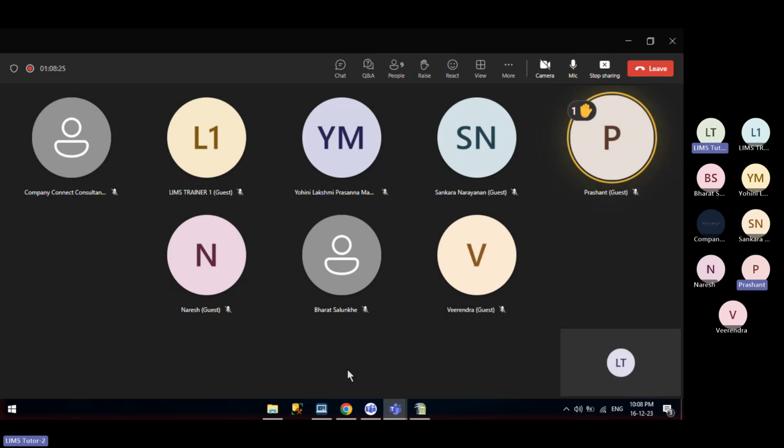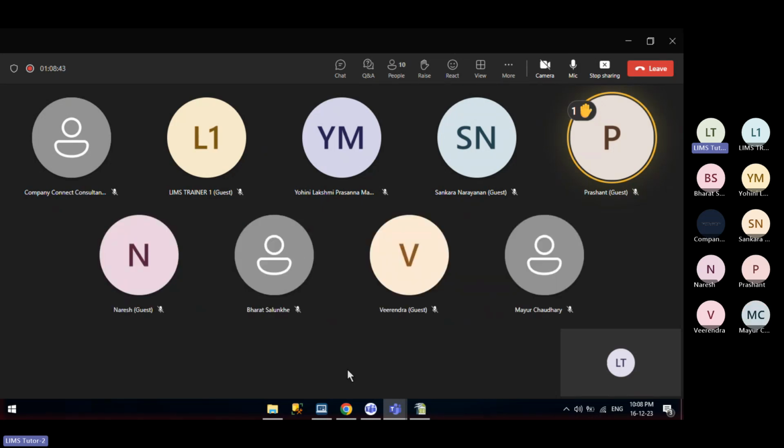Okay, so your last two questions. First, how the migration is handled. We are covering only how the master data is configured, but I will show you how the master data, once configured, can be transferred from one environment to another in a safe way. I will definitely cover that. I will show you a demo of that, although it is not part of this session.